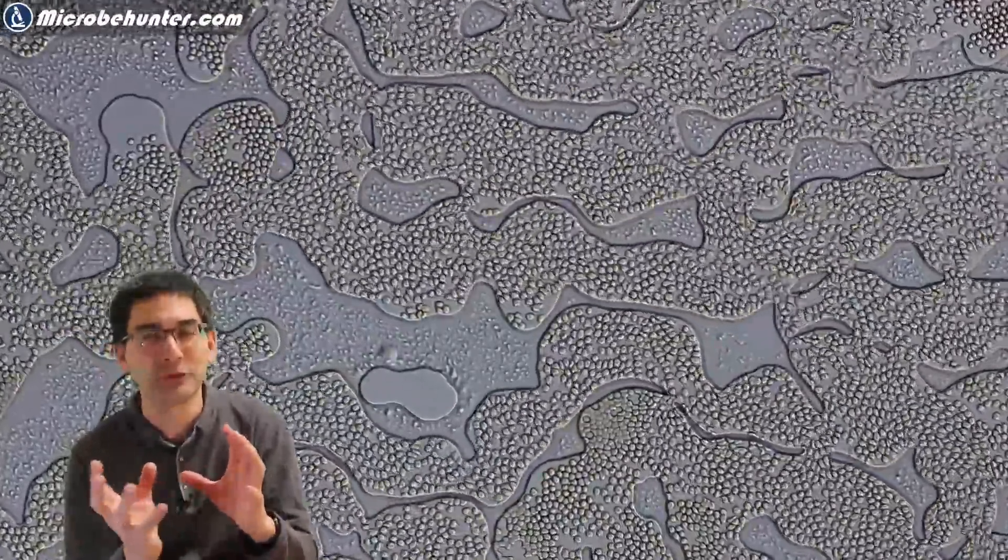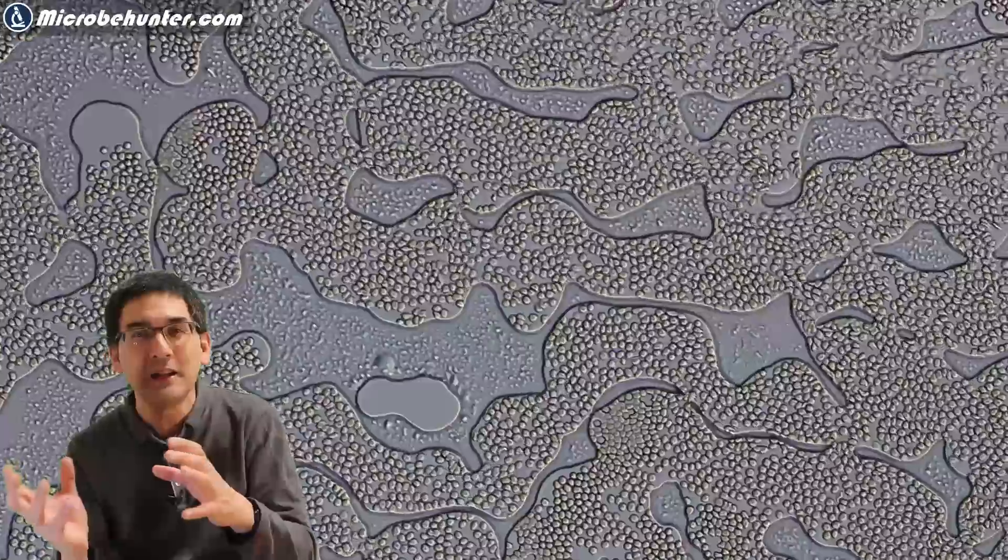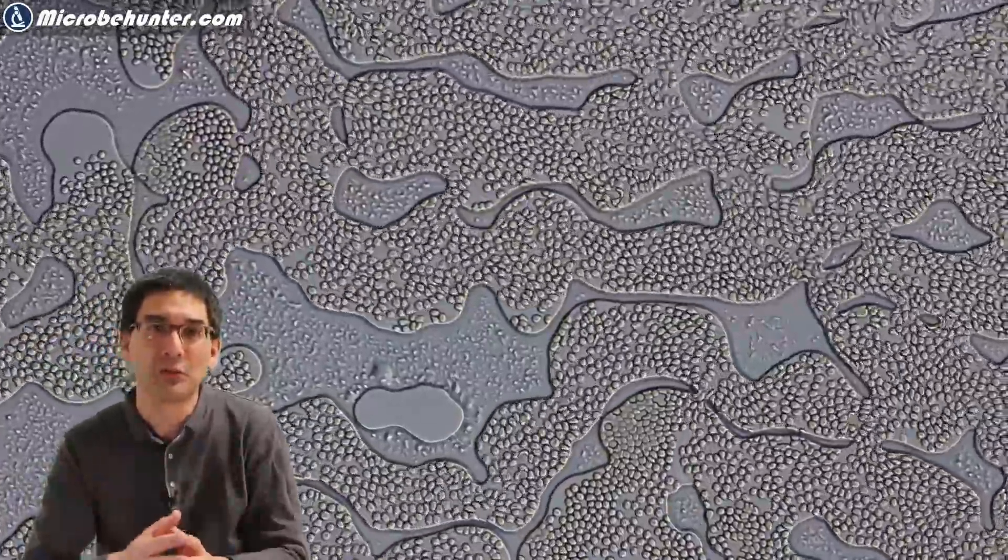The blood was spreading into a thin layer and you could see the red blood cells move under the microscope slide. They are pretty flexible and they bend. Essentially they are carried along by the bloodstream and they do not move on their own.